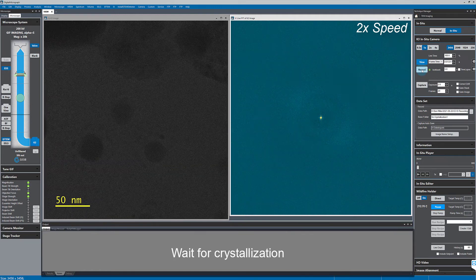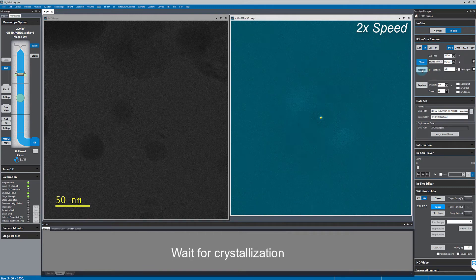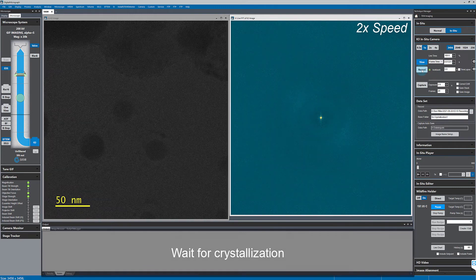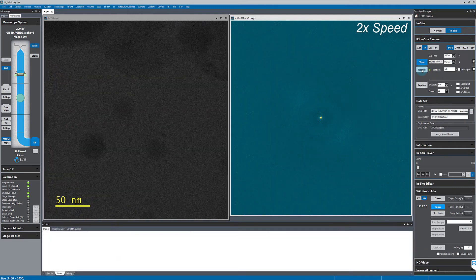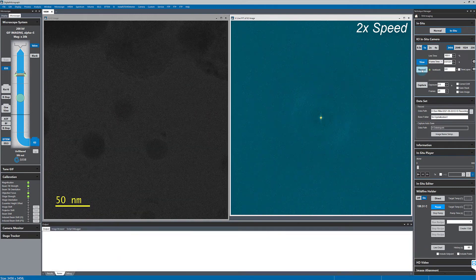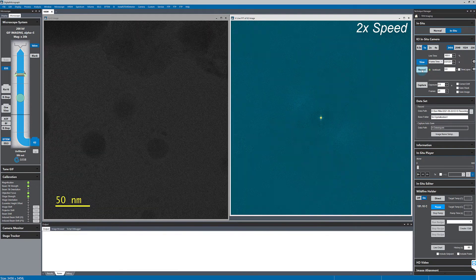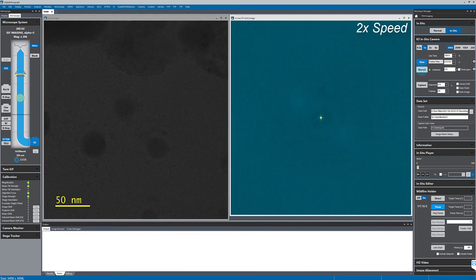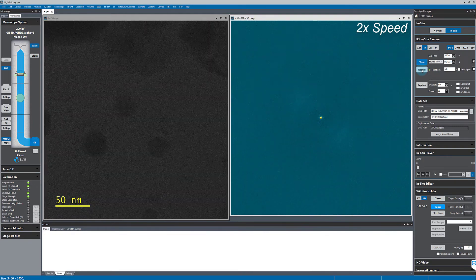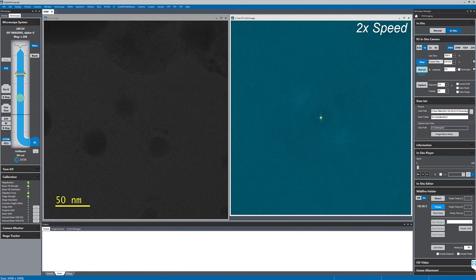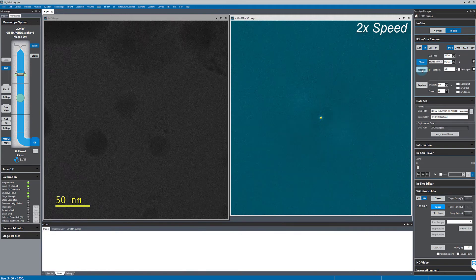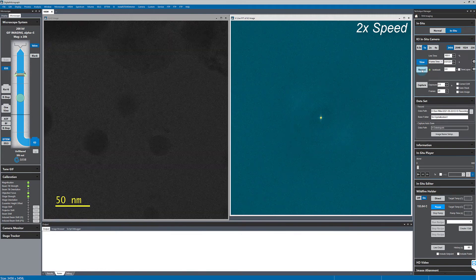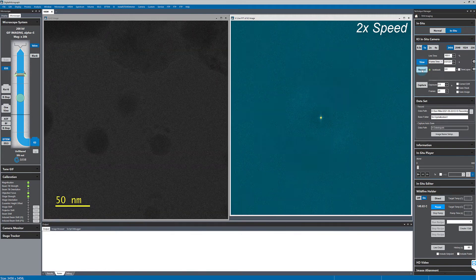But right when the tin crystallizes, I'm going to hit record. And because we have a look back buffer of five seconds, even though I pressed record after the crystallization happened, we'll still capture that moment of crystallization in the data set.